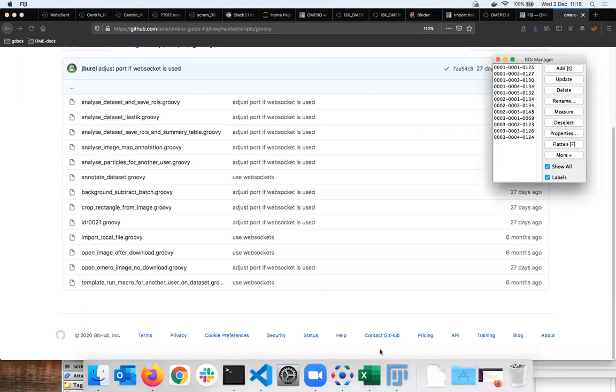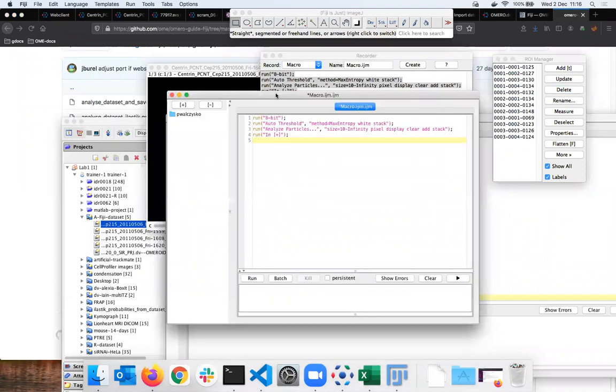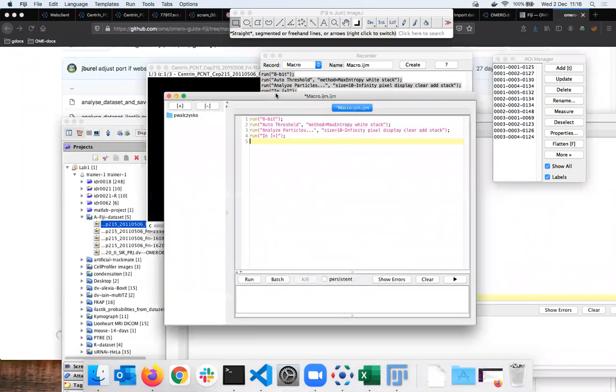But the key part when you do the analysis is that the analysis is done on the client's machine, that is on your laptop, or where Fiji is running. So the data need to be transferred from the server to your local machine and sent back. You could argue it would have been quicker to have the data directly on the machine. That's true. But the advantage of using OMERO is that you control and know where the data are, and you have the data accessible for further use.